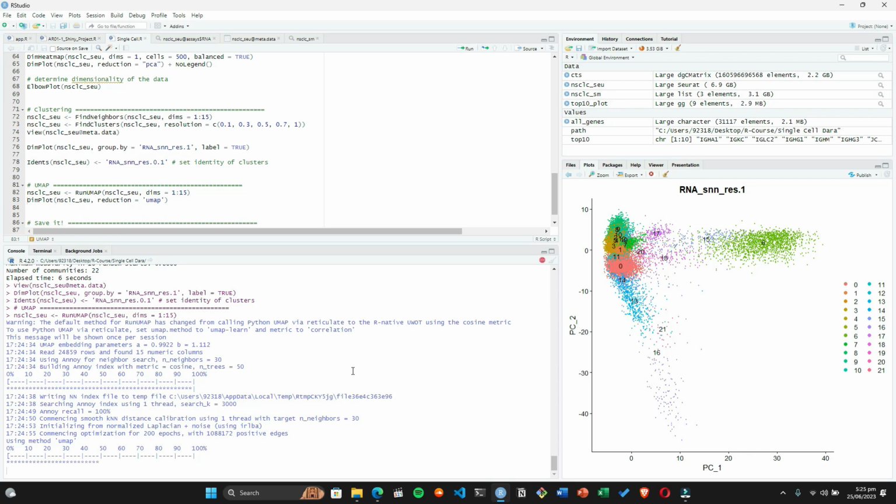So the plots of PCA2 and PCA1 are now being compared. So now we can use the elbow plot as well. So here is the PC plot of all the standard deviations. Now we can move on to clustering and finding the neighbors.